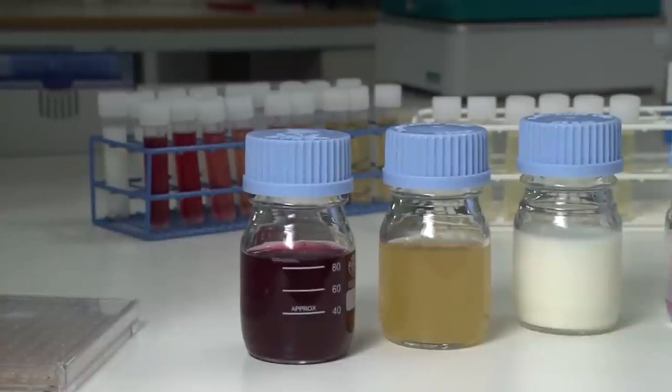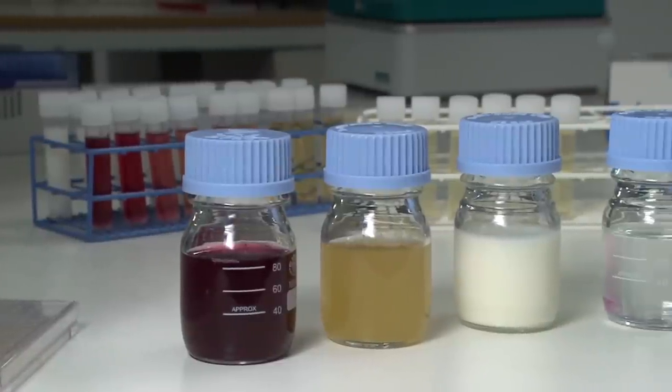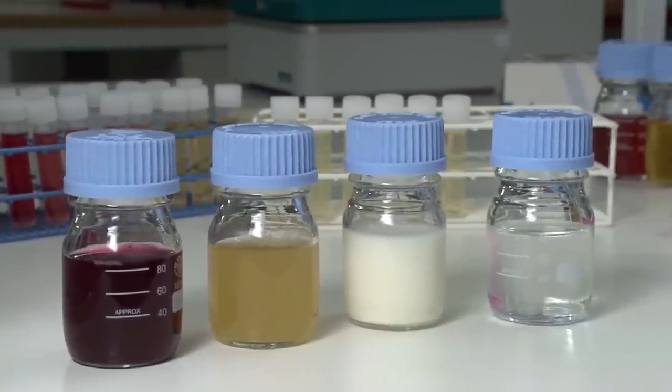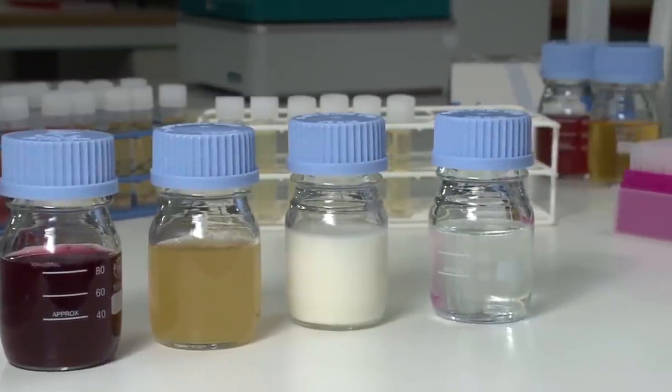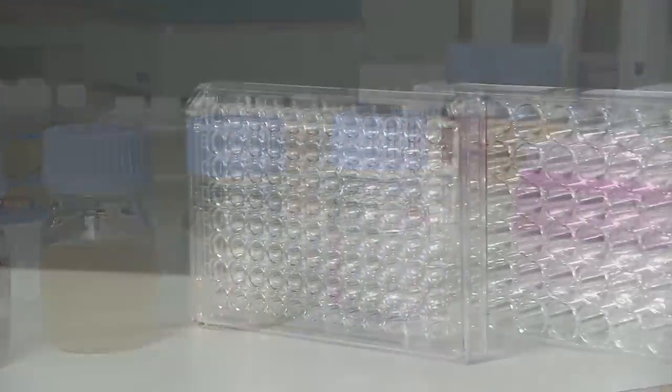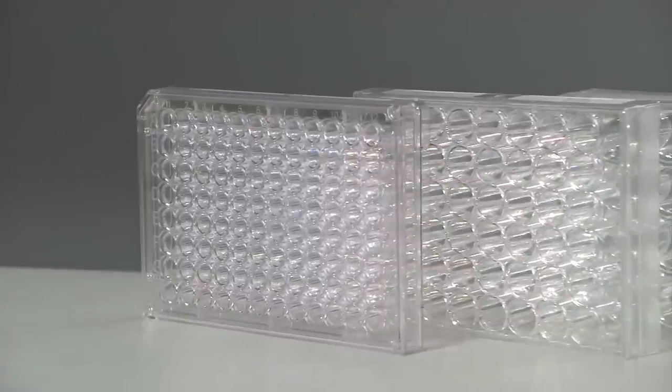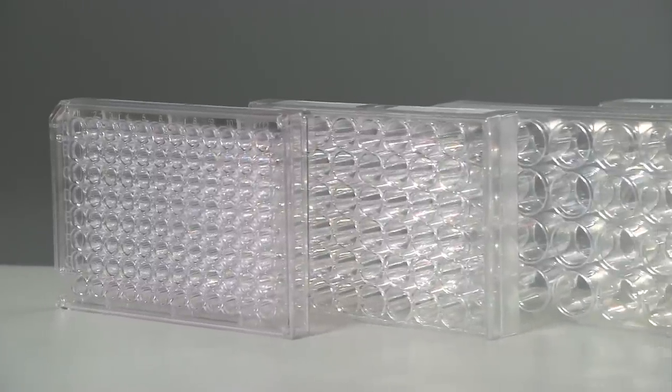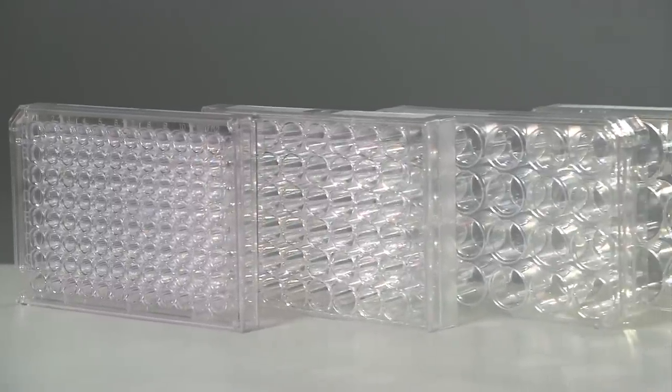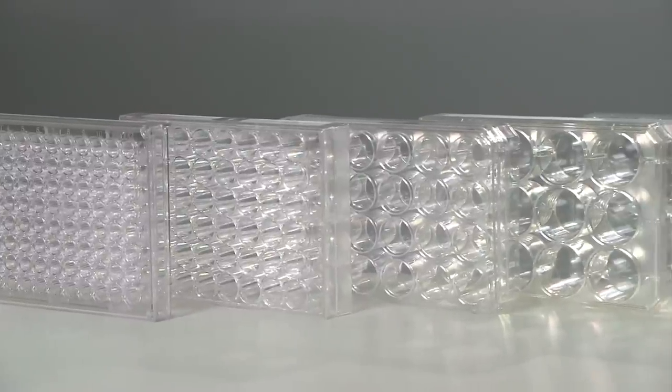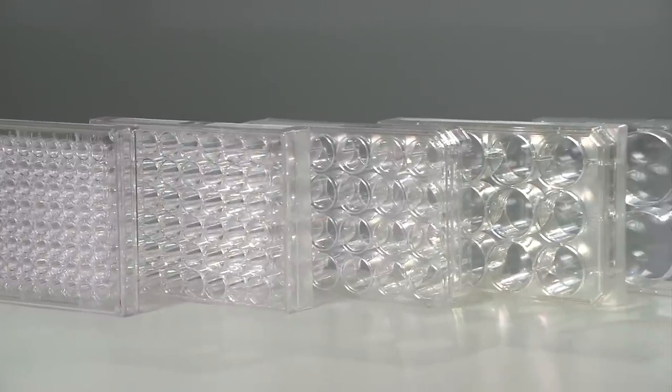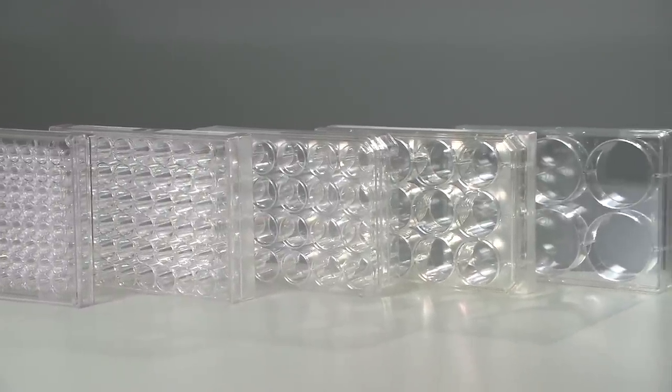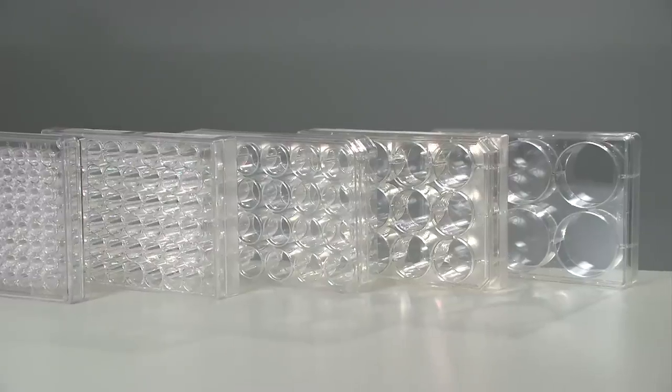Measurements can be taken from various different samples such as blood, urine, milk, and water. Ocelloscope can use standard microtiter plates and supports, for example, 96, 48, 24, 12, and 6-well plates.